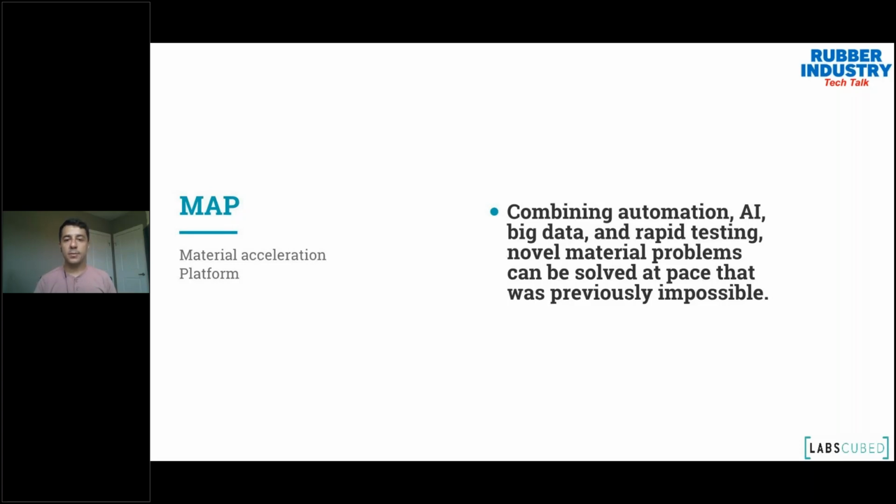So let's say a customer comes along and wants to change the properties or wants new properties. Or today, sustainability being a big thing that we're all pushing for, we need to create really sustainable rubbers and materials. Well, we have to test a lot of ingredients, and we have to test how they combine and the final results a lot to get a really good sustainable material that's also a great material for customers. So you could do that using these fully automated labs.